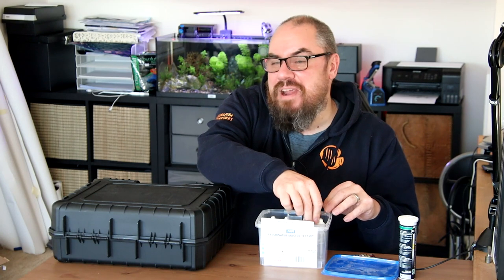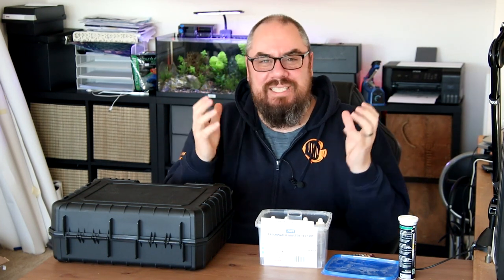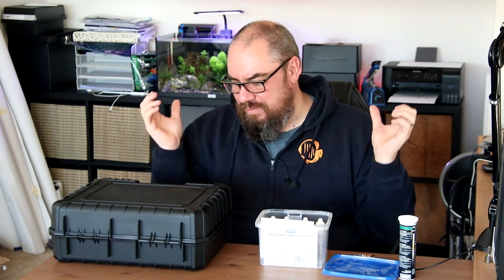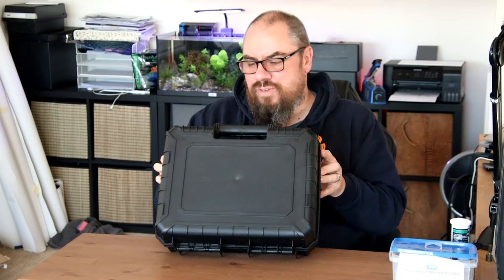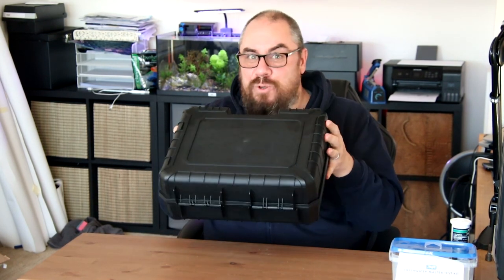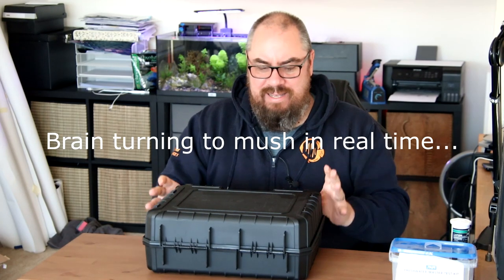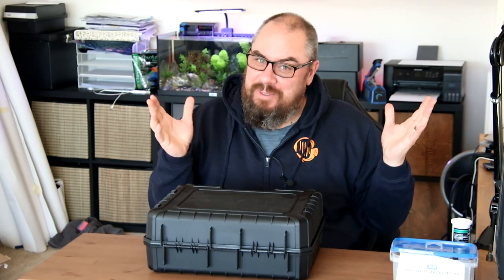Then you have the crème de la crème, which might be something like the Hanna Checkers, which spit out a number. That's really the goal — I've always wanted something to do that, but they're really expensive. But I've got this today. This arrived in the post a little while ago from a company in Poland. It's called the Diode Probe, and it's a spectrophotometer — it uses lasers, basically.